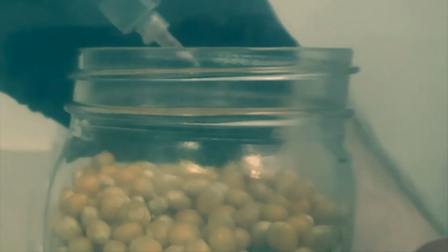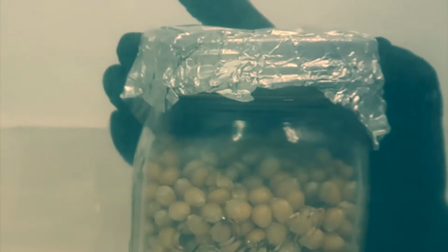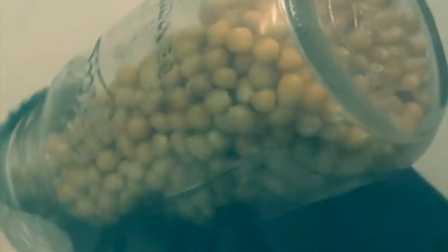I'll just squirt some around the sides of the jar. With the liquid culture inoculation, since it's already got viable and established mycelium in the syringe, we can tighten this lid up just a little bit and mix these grains around to distribute this liquid culture throughout the grains. This is going to help increase all of the inoculation points of the liquid culture so the mycelium has more grains spread out to start growing on for faster colonization.